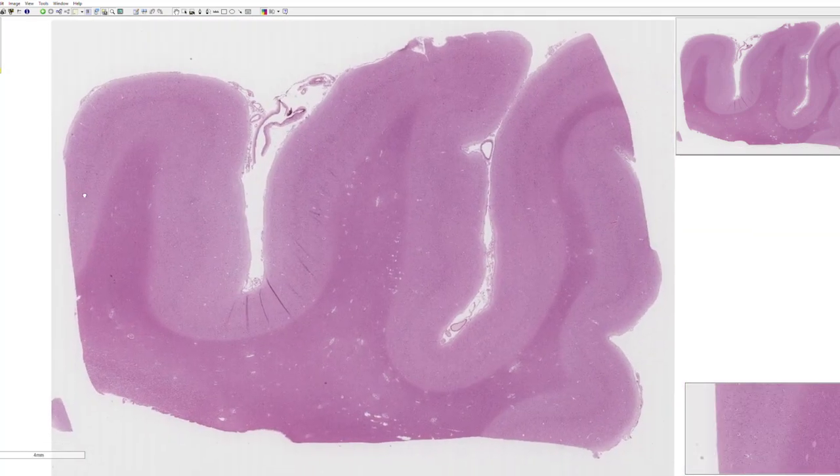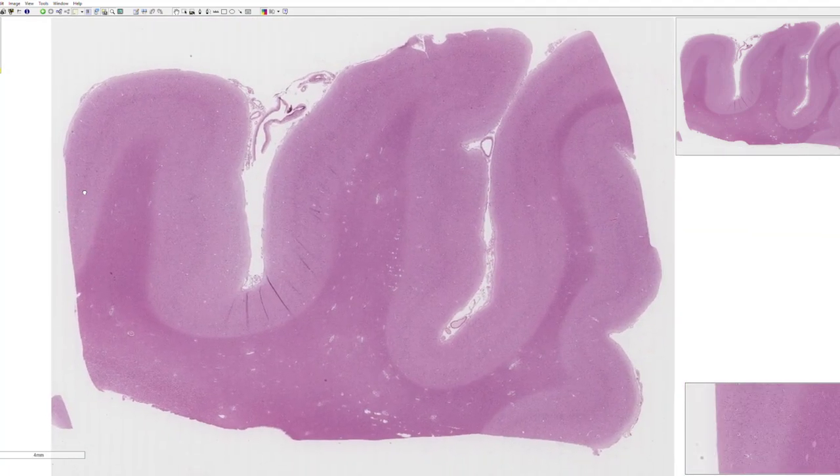So what we covered today is an H&E stain, a hematoxylin and eosin stain. It's probably the most versatile stain in the pathology lab, but there are of course other stains that accentuate some of the features of the nervous system. There are some stains that stain the white matter, as we'll see, such as Luxol fast blue, and there are some immunostains that label the neurons specifically and allow you to better see this organization, both the perpendicular layers and also the radially organized mini columns.